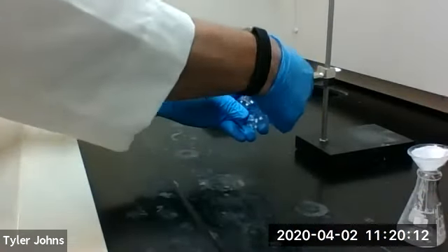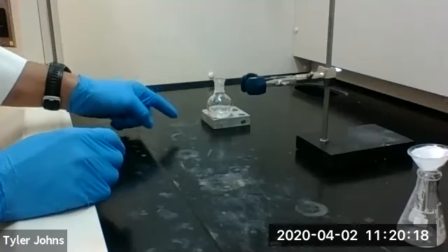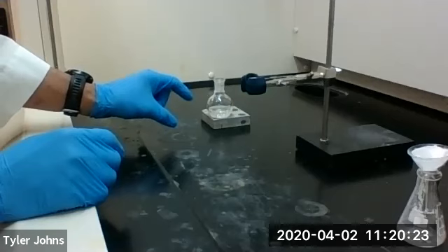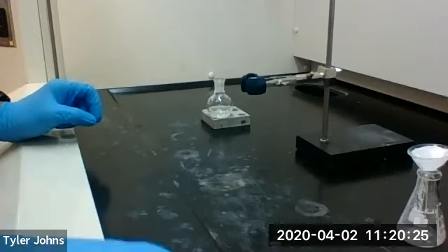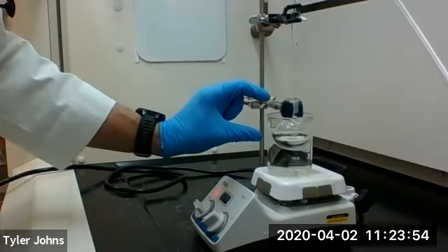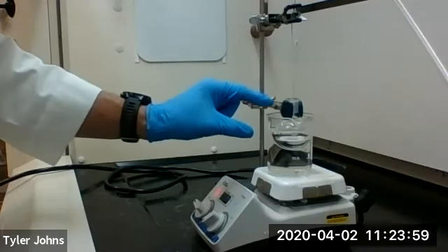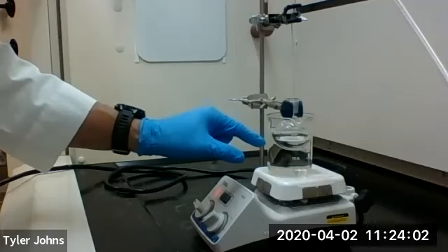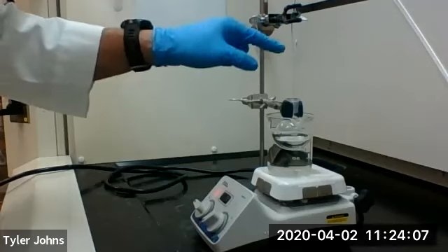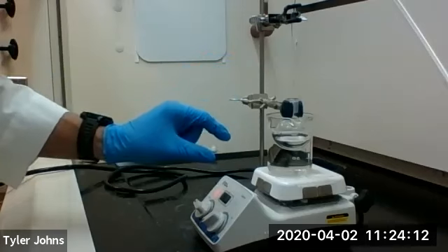We're going to remove this from the clamp. We're now going to get a water bath set up to evaporate the diethyl ether so that we're left with our solid epoxide product. So we have our 50 ml round bottom flask with our diethyl ether extracts inside a warm water bath, and we're directing a stream of air to help drive off the diethyl ether. We'll let this go until we're left with our solid epoxide.